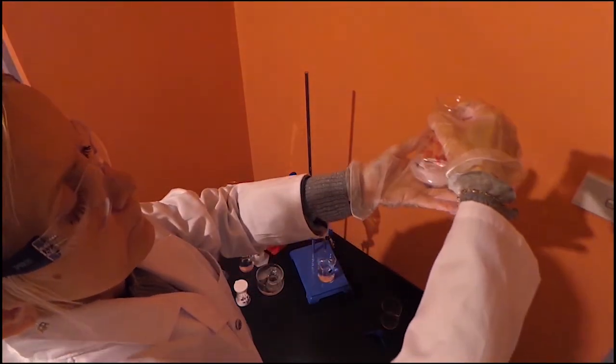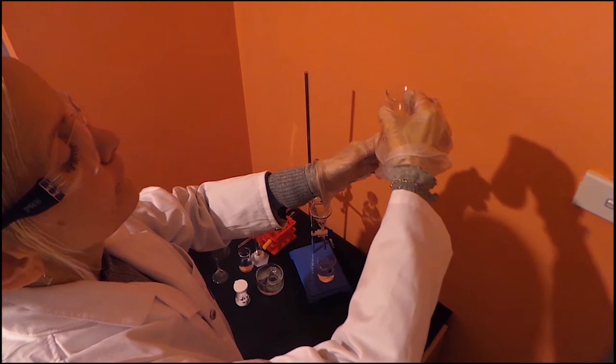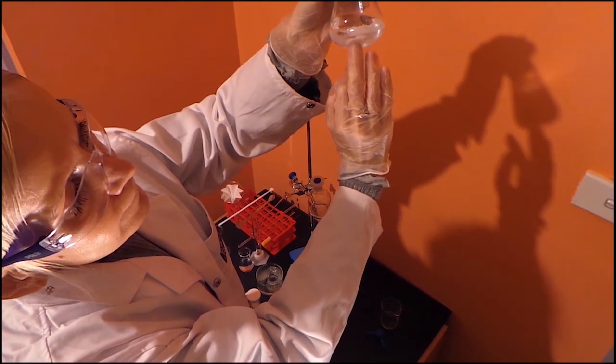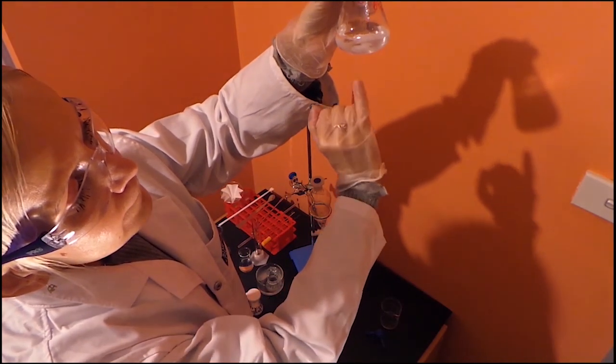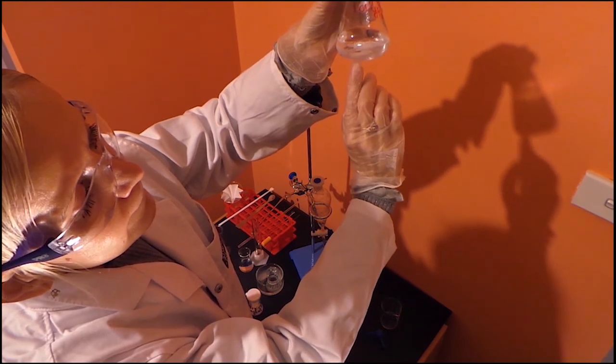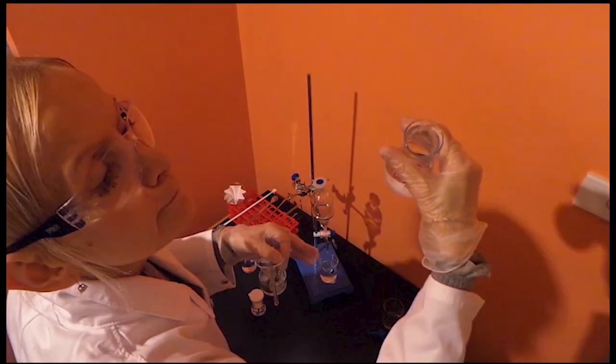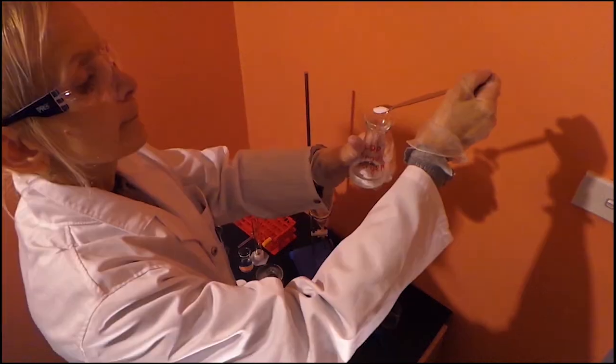After adding a small amount, swirl the mixture in the flask. We can see the sodium sulfate clumps together sticking to the bottom of the flask. Since the majority of the sodium sulfate has clumped, we need to add a bit more.